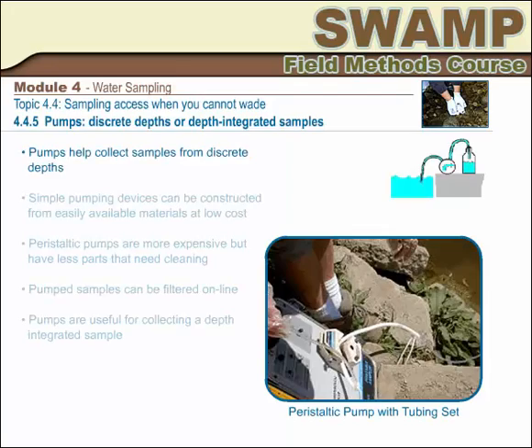Pumps equipped with tubing are used to collect variable volumes of water from a discrete depth. Pumps can be easily constructed from available materials, such as a large syringe, tubing, and a three-way stopcock, or an inverted bicycle pump connected to a sturdy bottle that serves as a vacuum chamber into which the tubing brings the sample. Please contact the Clean Water team for more information about these devices.